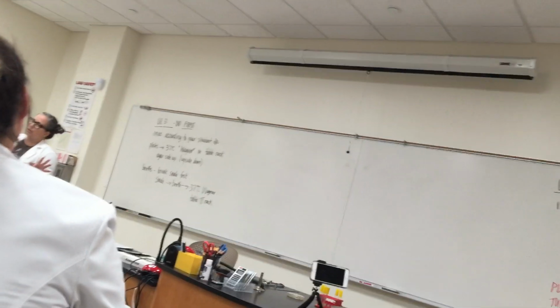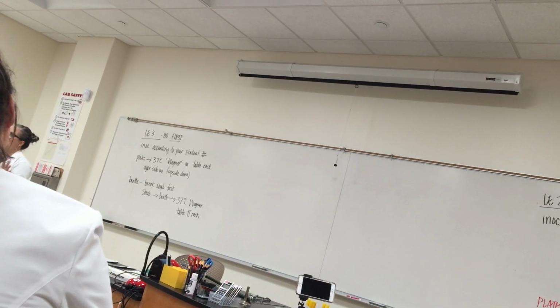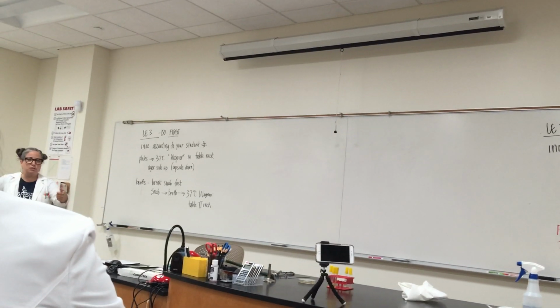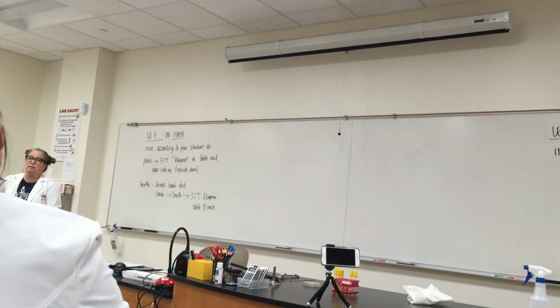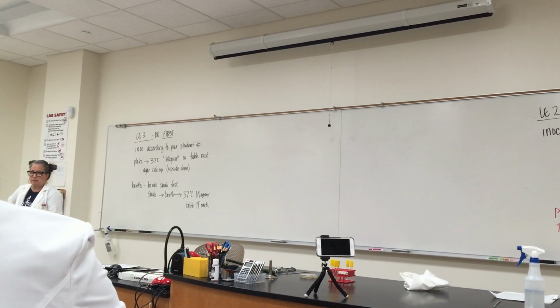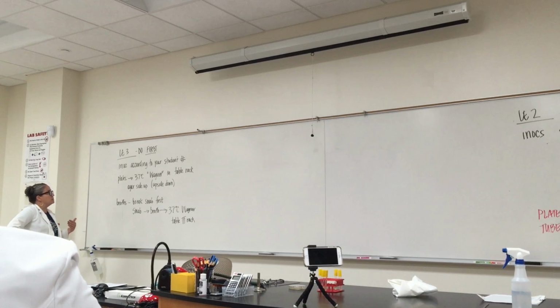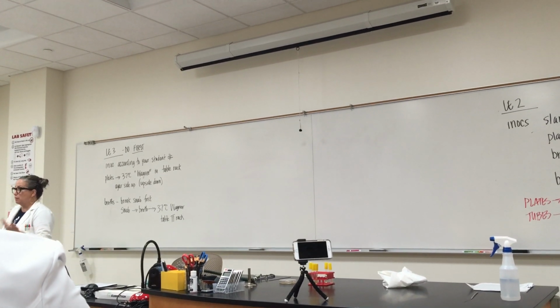We know we hate big words. Ubiquity is not a science word. It's a regular old word. It means everywhere. So we're going to test that theory. You are going to be exposing petri dishes and broths to all sorts of different environments to see if there are microorganisms present. Because microorganisms are microscopic, we can't see them unless we grow them. So we are going to grow those on petri dishes, and we are going to grow those into broth, right?